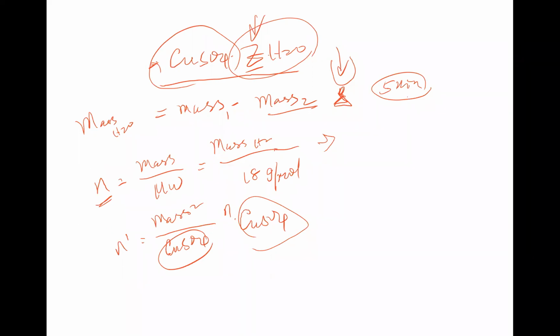Now another thing: when you put your sample in the crucible and cover the lid, you cannot fully cover it, because when the water vaporizes, it will condense at the top of the lid. So you actually do not completely remove it. You have to leave some opening to allow the water to evaporate and get out of the crucible. So that's how you will completely remove the water. Anyway, let's go.